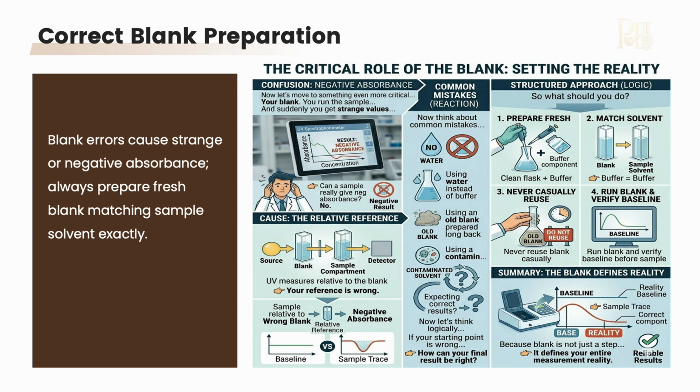Now think about the common mistakes. Using water instead of buffer, using an old blank prepared long back, using a contaminated solvent, and then expecting correct results. Now let's think logically. If your starting point itself is wrong, how can your final result be right?